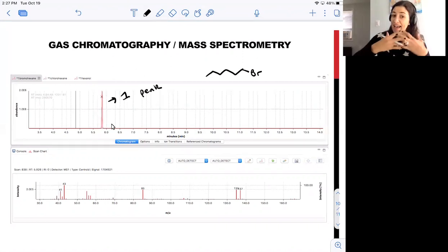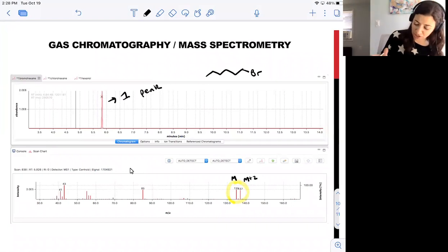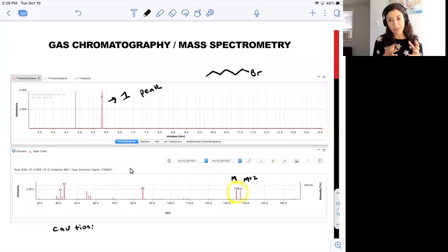In addition to being able to say at five and a half to six minutes I have material coming out of the column, if I double click on the peak in the software, I can actually pull up the mass spectrometry data that was collected by the mass detector for all of the molecules that exited the column during that time point. What I can see, if I bring my eye far to the right here, is what I like to call the twin peaks at 135 and 137. You'll recall that when we have an M and an M plus 2 that are equal in height, it typically indicates the presence of a bromine atom.